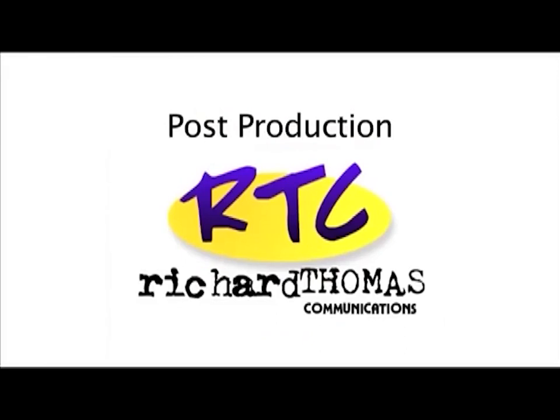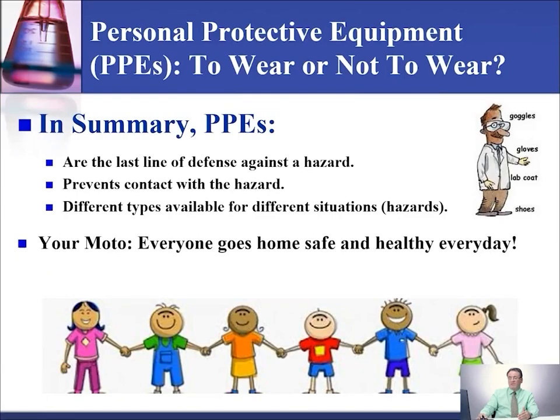So, in summary, PPEs are the last line of defense against a hazard. They prevent contact with the hazard. Different types are available for different situations or different hazards. Your motto should be: everyone goes home safe and healthy every day.